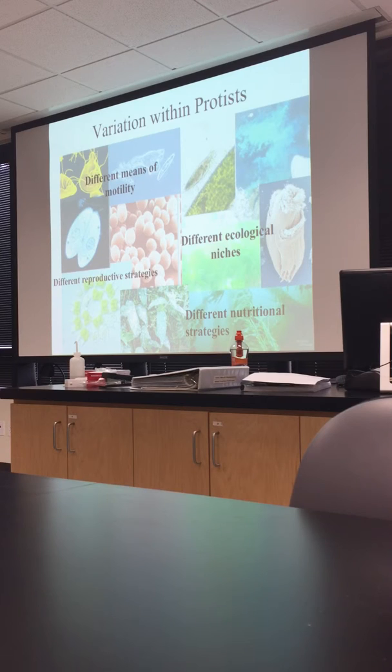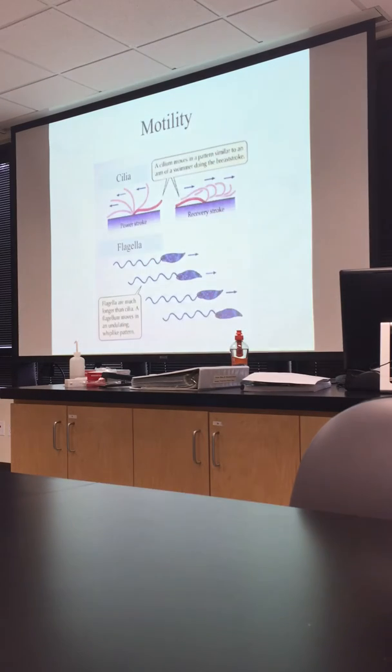So even if you can't identify the microscope slide, you should at least get partial credit. What slide numbers did you say it was for? 56 through 69, and they're color coded in the slide box. What would you say to know about the slides to start with? Varied. Just that they're varied.